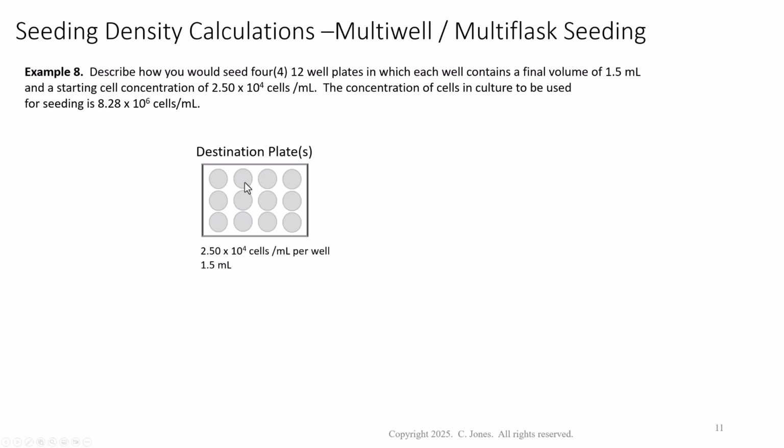And remember, if you've looked at my lab math videos in the statistics part, we always like to do things in triplicate. So we'd have 3 different doses here. 0 drug, dose number 1, dose number 2, dose number 3. And the only thing that we want to change is the drug, right? We want each well to have exactly the same number of cells so that the effects we see are due to the drug, not due to the number of cells per well.